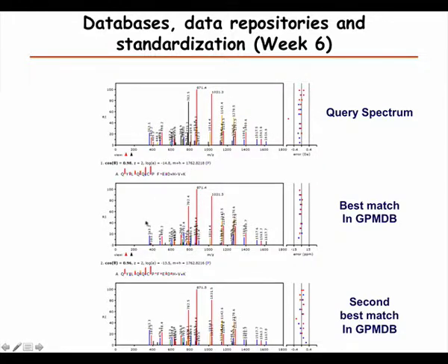That's one thing we see: if the same fragmentation technique is used, the relative intensities of the peaks in the fragment mass spectrum depend on the sequence of the peptide. So that's a signature that we can use to validate also.